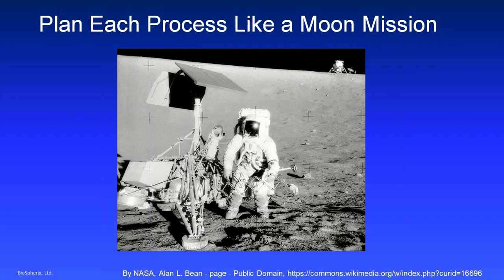And we have had people that have gotten so frustrated because they didn't plan well that they have actually breached the system in order to just throw things in there and work with them. And, we don't want you to experience this frustration. And the key is really having a good plan.